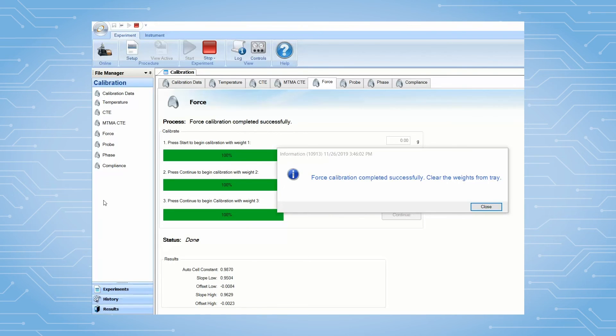Once this third step is complete, you will see a pop-up message indicating the success of the calibration.